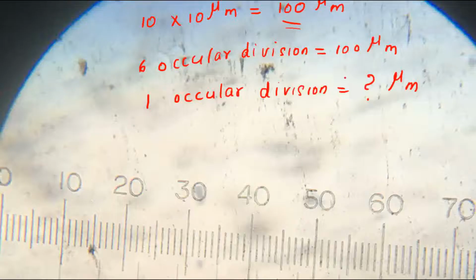For that we need to cross multiply this one. In this way, I am going to cross multiply.